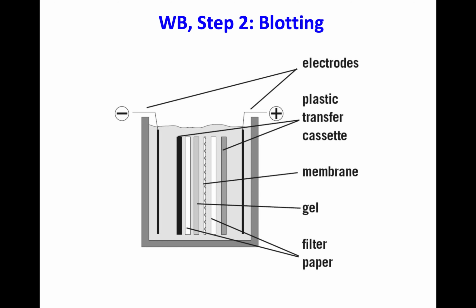Now, why couldn't we do this for DNA? Try and Google up the answer. There's actually a reason why. Basically, your blotting for Western blot is more or less similar to the build-up when you do blotting for nucleotides. So you have your membrane in the middle, and then in between them, of course, you need to have your gels for the transfer to the membrane.